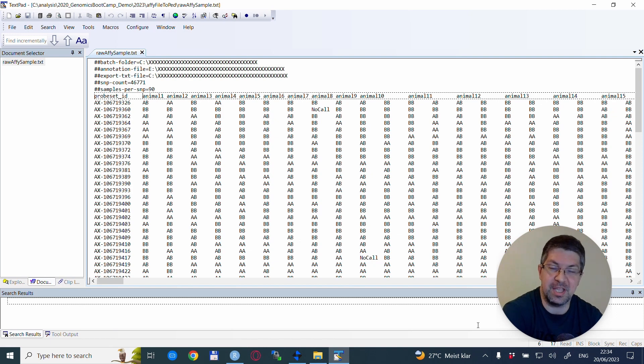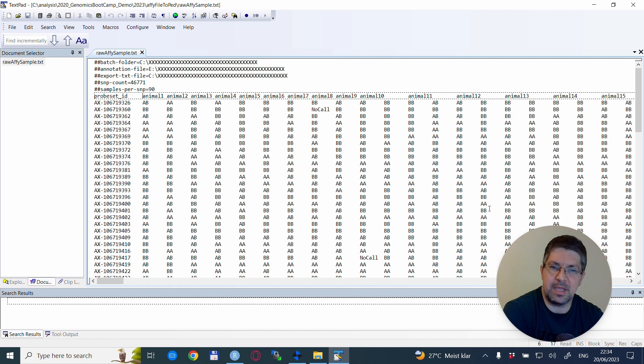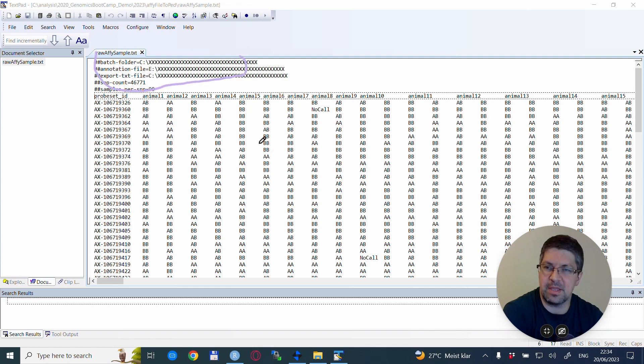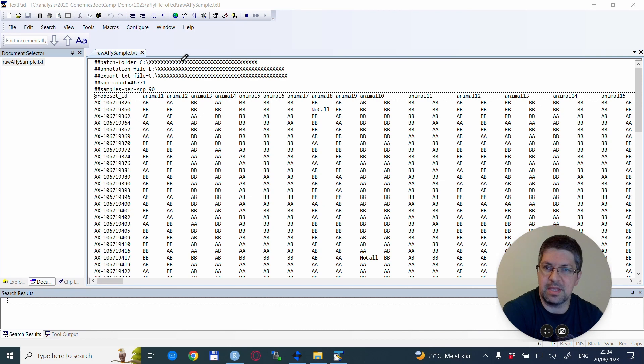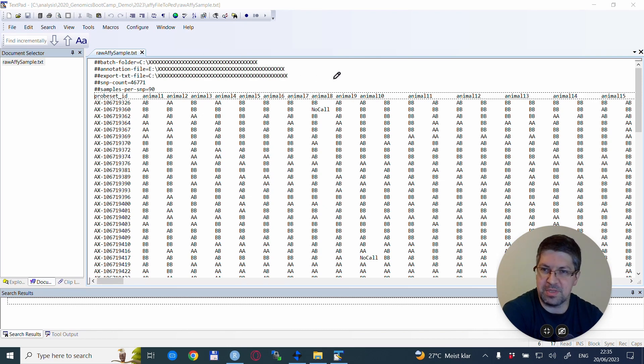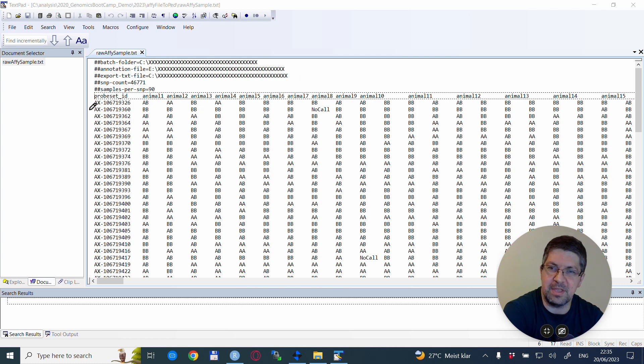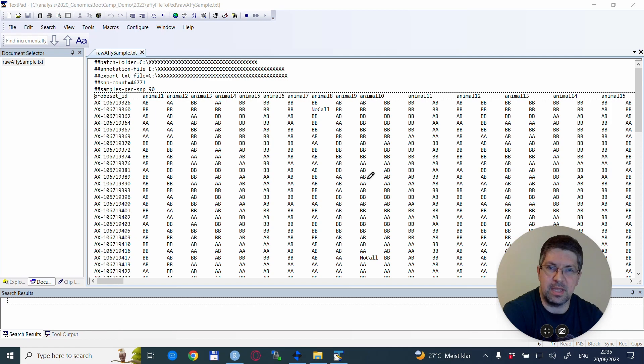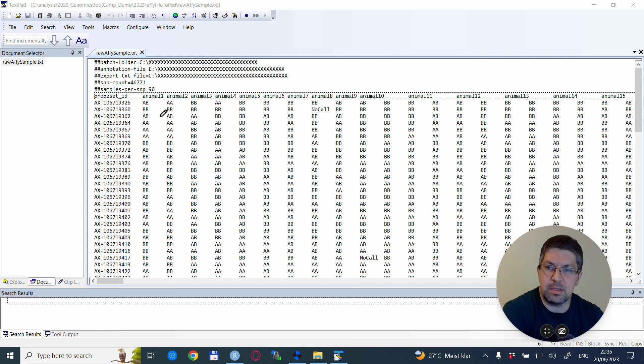So this is how it looks like. We have a few lines here that are just kind of introductory things. I X'd out quite a bit here just to make it anonymous, but the file format is that each line is a SNP, and then the columns are the animals or the individuals.